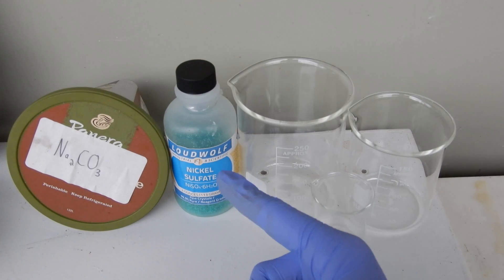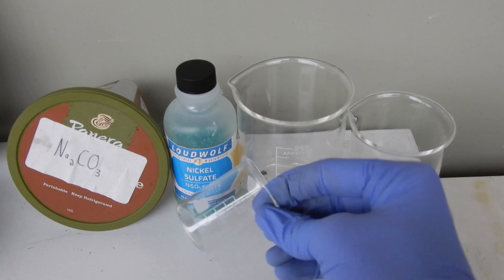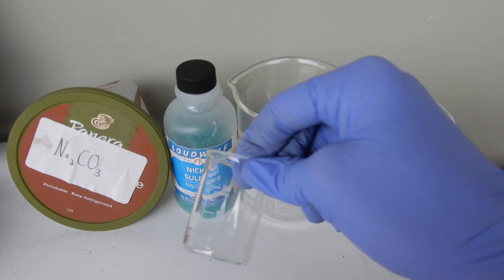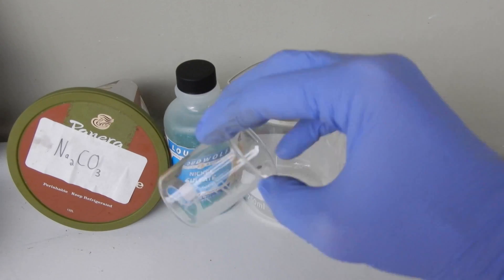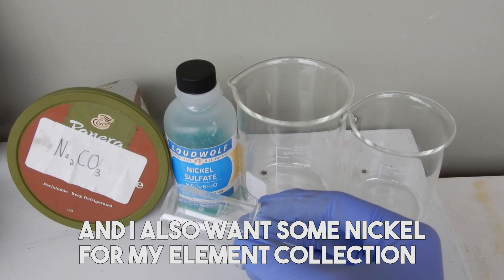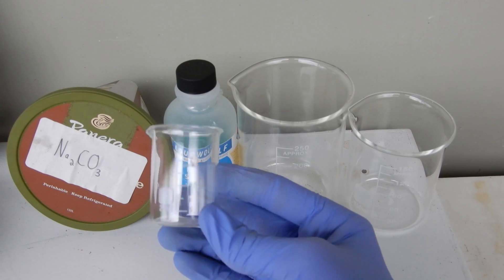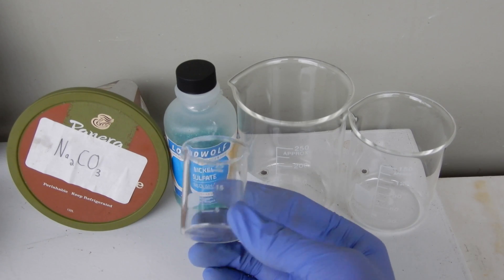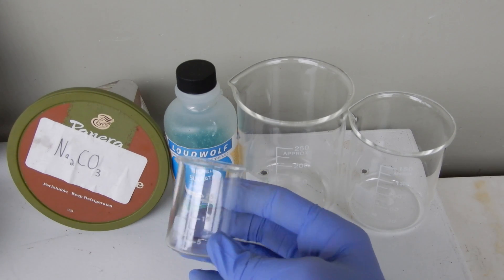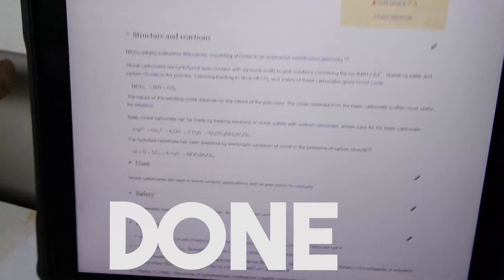The first thing we're going to do is weigh out some nickel sulfate into this little 25 milliliter beaker, because I don't want to use that much. I'm really just doing this for the chemistry, or like the demo really of the nickel oxide thermite. I'll put some in here, see how many grams that is, and figure out the stoichiometry from there using this article from Wikipedia.